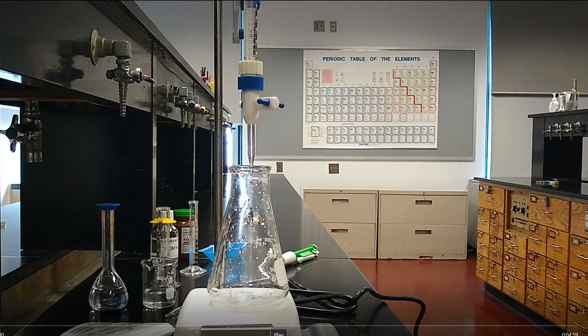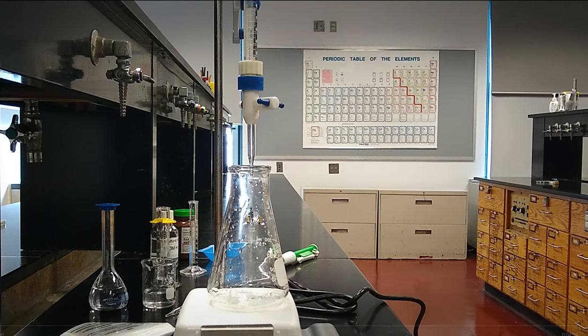Hello Chemists! This is Ms. Pluccino and you are watching a lab tutorial video for lab number six, the analysis of bleach. During this lab we're going to be running a bunch of titrations.